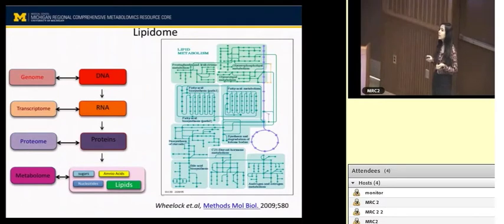They're not going to be as many lipids as we see in our lipidomics platform, but they are still there. Actually, there are a lot of them in the metabolomics platform, and they're not very well identified. Most of them are unknowns, but we know there are major classes of lipids that we do see in our metabolomics package as well.